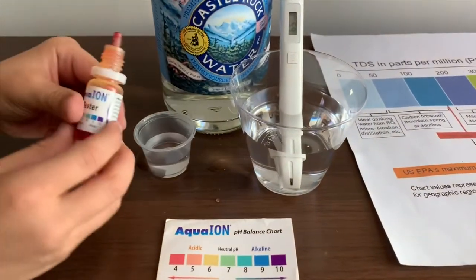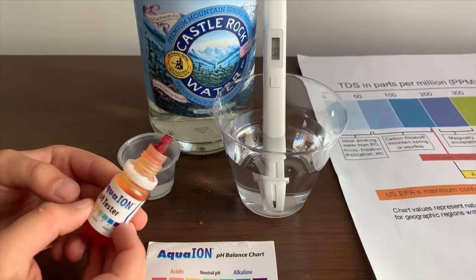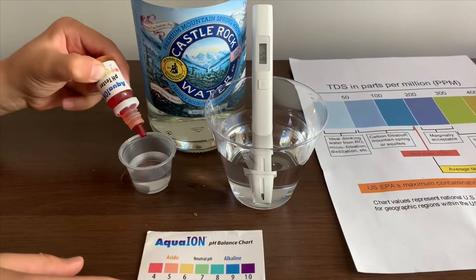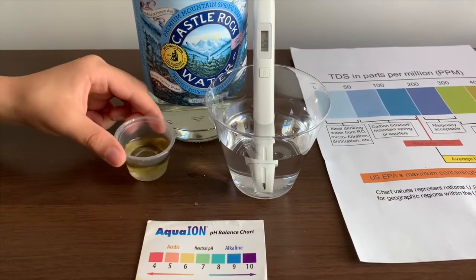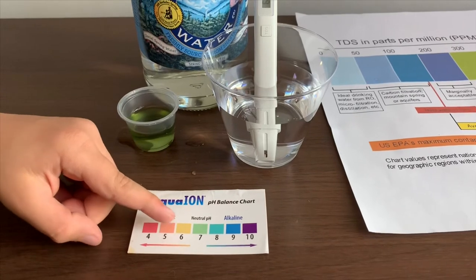Now let's test the pH. If you want to buy this pH tester, check the link down below. Only do two drops. Let's stir it a little. This is 7. This is neutral pH.